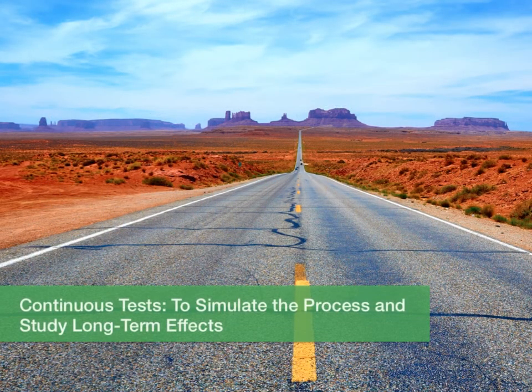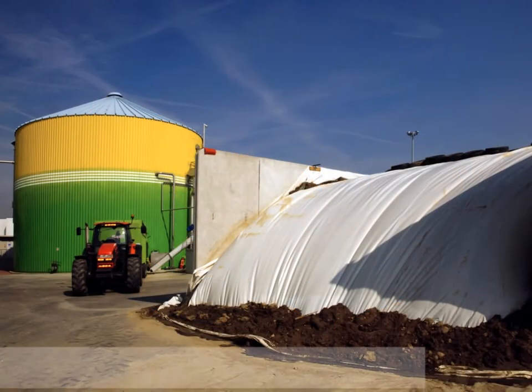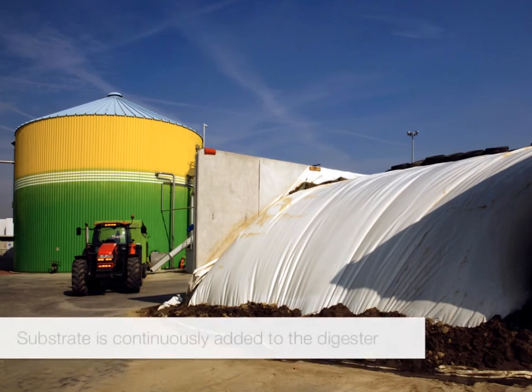Continuous tests to simulate the process and study long-term effects. Continuous tests simulate a full-scale process by performing experimental tests in a continuous mode. This means that substrate is continuously added to the digester so that you can analyze performance over a long period of time.